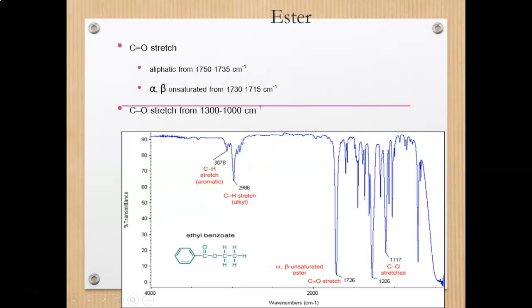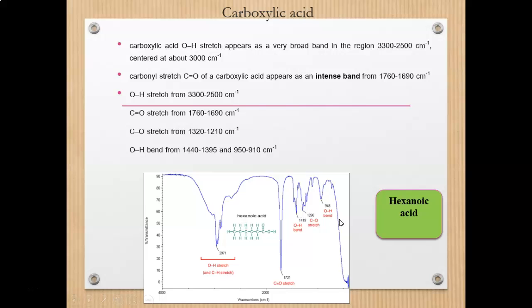We have CO stretch ester. Okay. Untuk structure yang ni awak kena cari dia punya benzene ring dia, C double bond C double bond C lah, C double bond O. Okay. So macam tu lah, nanti saya bagi example. Don't worry. Alright, this one is carboxylic acid.